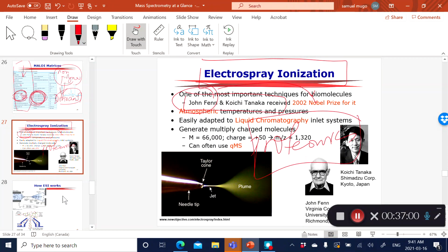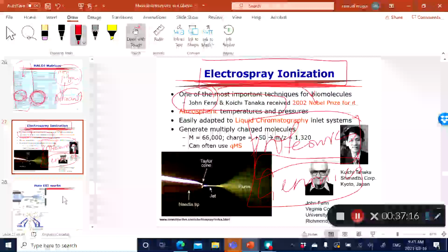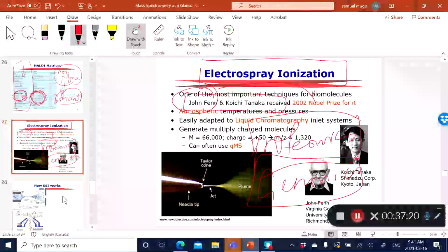which is a big field of study out there. And of course, it also revolutionized genomics as well. The genes and the proteins are what are expressed by the genes, so it's a connected field. Previously it was very difficult to analyze proteins without digesting them with an enzyme.